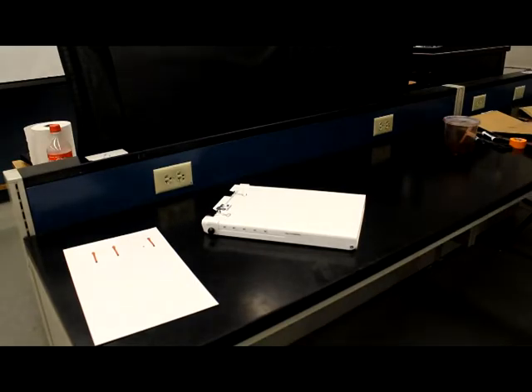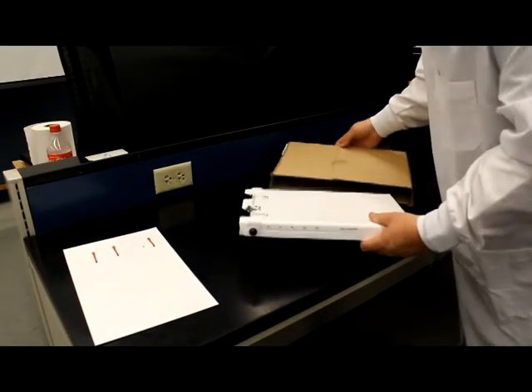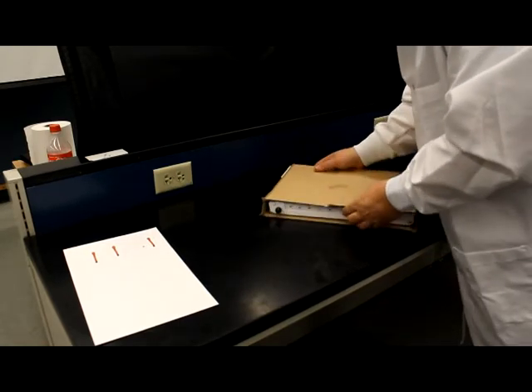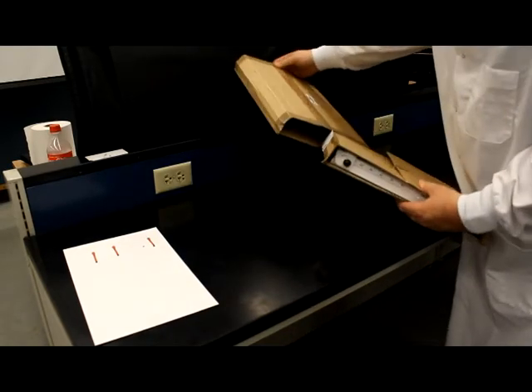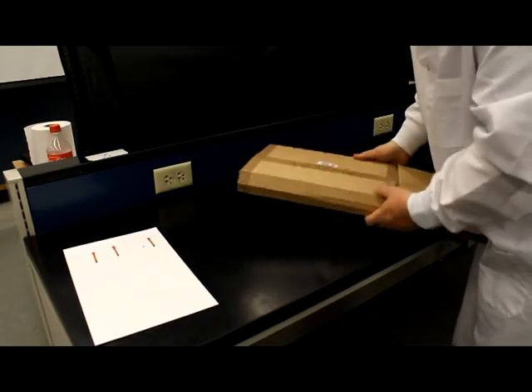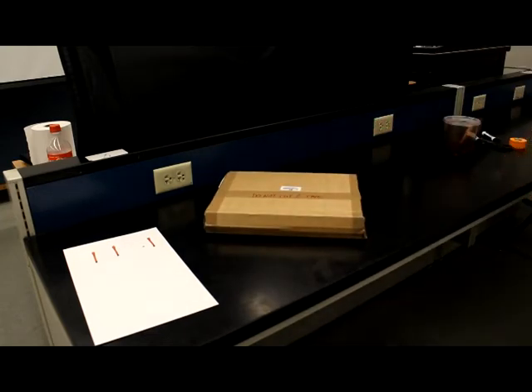If your apparatus came in its box, you're going to then want to go ahead and place it back in the box, so it can be stored away for the next time it needs to be used. And that's how you properly take care of the blood spatter apparatus.